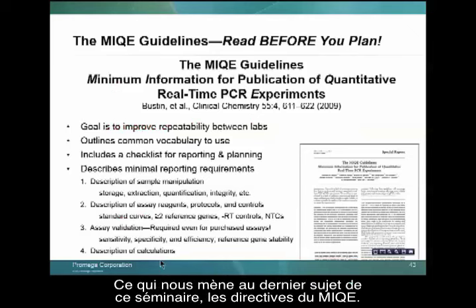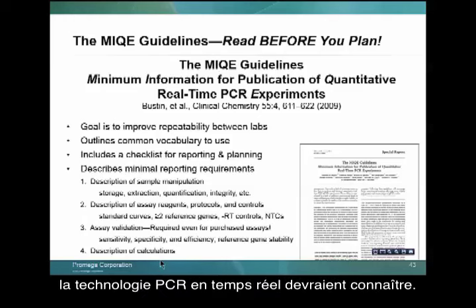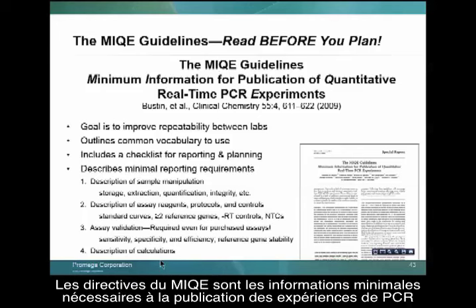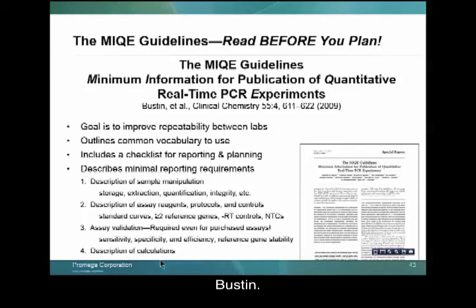Which brings me to my last point, the MIQE guidelines. This should be a document that everybody who performs real-time PCR is familiar with. The MIQE guidelines are the Minimum Information for publication of Quantitative real-time PCR Experiments by my hero, Mr. Bustin.